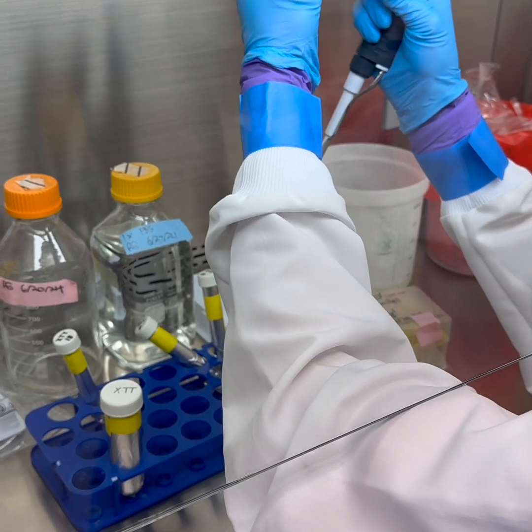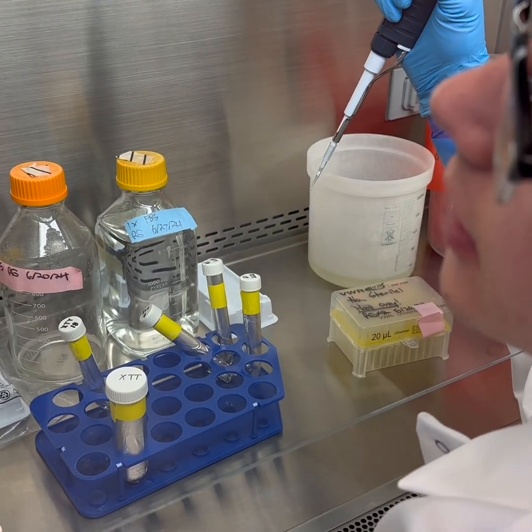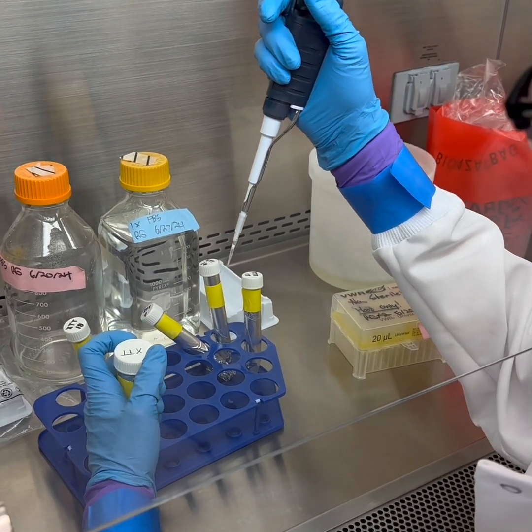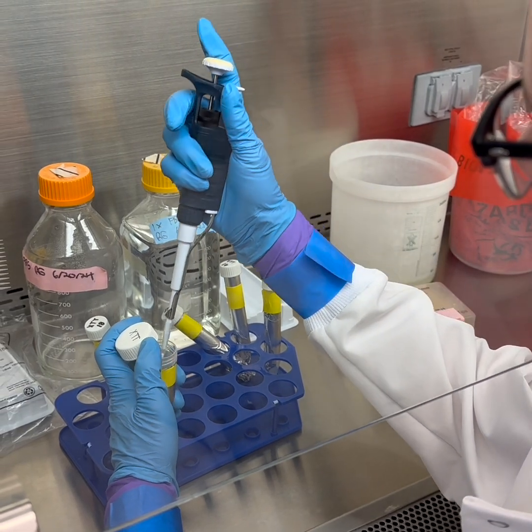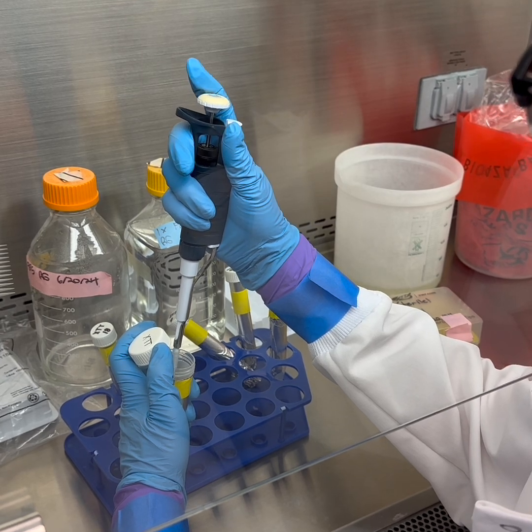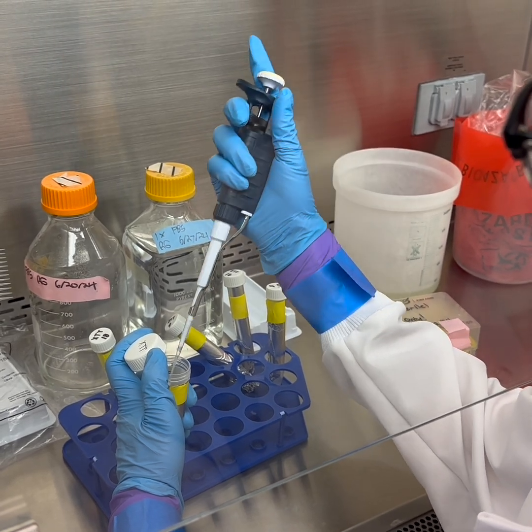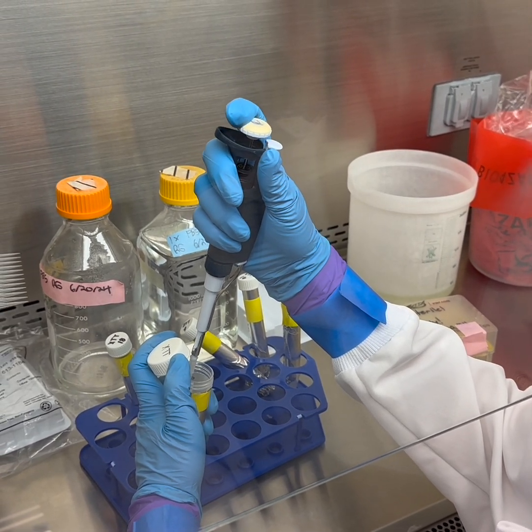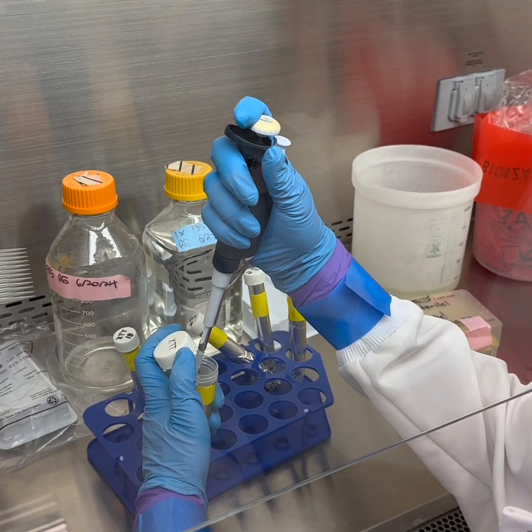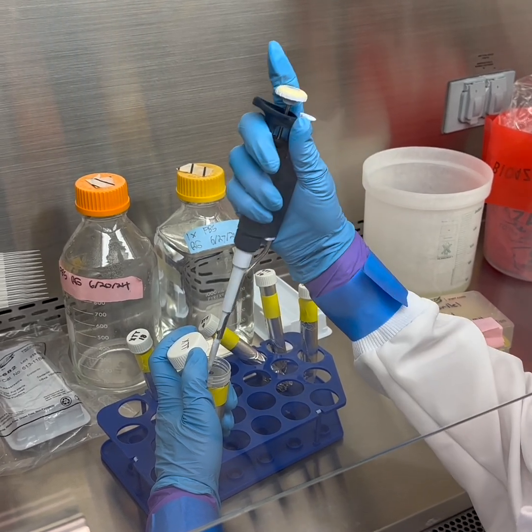This evaporates quickly because it's dissolved in acetone, and so you want to be pretty quick about it. And I would wash a couple times once you're in there. Okay, should be good.